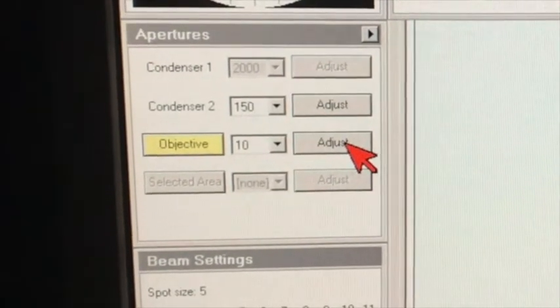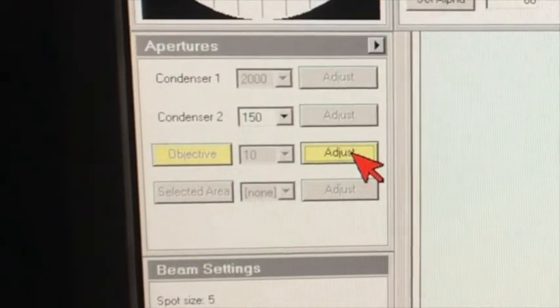Let's center the diffraction pattern a little bit using the multi-function knobs. Now let's use a smaller objective aperture, like a 10 micron objective aperture. This is off-center. To center the objective aperture, we click on Adjust and use the multi-function X and Y knobs, which control the aperture position. We move the aperture to the transmitted beam to form the bright field image.